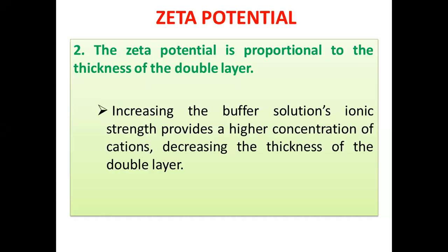If you use a buffer which has higher ionic strength, in higher concentration with respect to cations, there is no significance to the anions such as silanolate groups, because anions of the buffer are coordinating with the cations of the buffer. So there is no question of tightly binding with the silanolate anions of the capillary tube. Therefore, the electro-osmotic flow can be decreased.